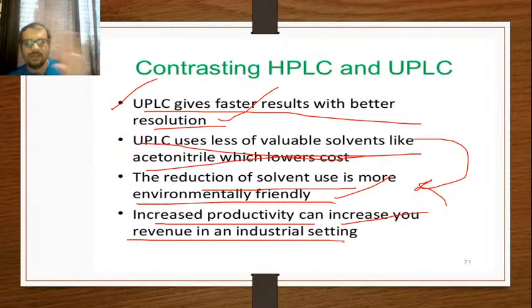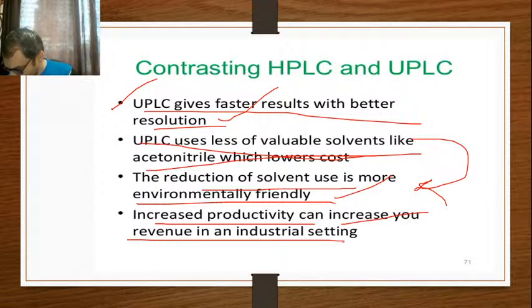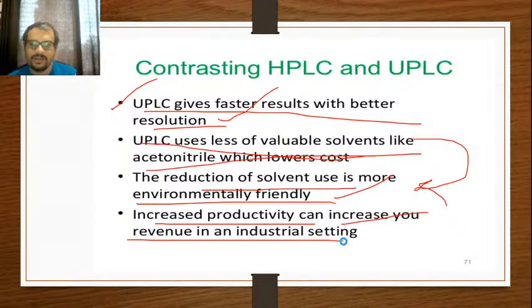Apart from this, you can easily contrast that UPLC employs higher pressure and smaller particles compared to HPLC. Okay, so this summarizes your chapter on HPLC. I think this is sufficient for you guys. We will cover the next topic in the next session.